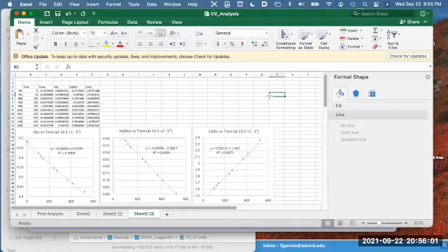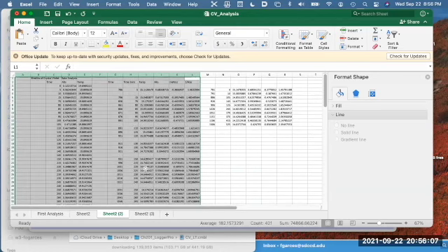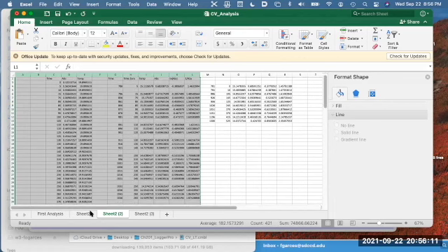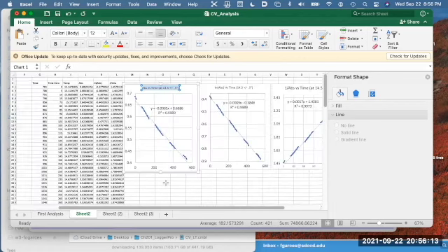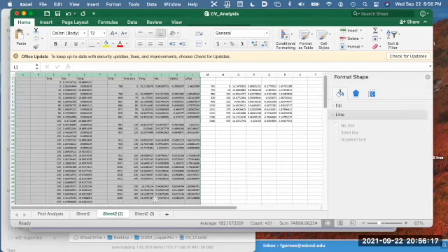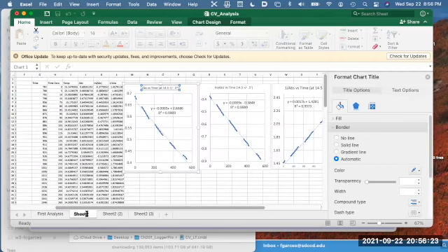And we're almost finished here. What I just want to show you is when I go to a different sheet and look at the graph that was generated using the whole data set, absorbance versus time was 0.9909, as you can see here. And then when we compare it to one in which we just have selected, that too was 0.9909.